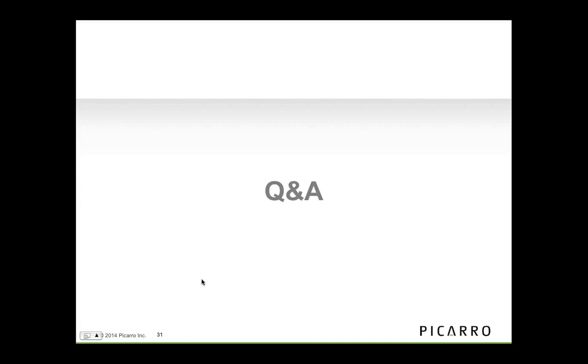Okay. I have a question regarding the FD, the forced diffusion chamber. It says, can you tell me more about the forced diffusion chamber, how it works? And the other question was, how do you maintain the soil humidity and temperature equal to the exterior of the chamber soil while the chamber is installed on the soil?